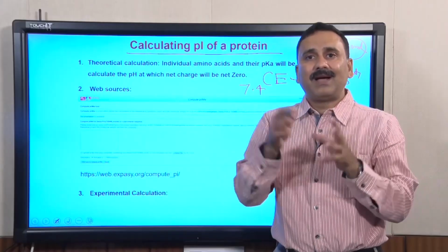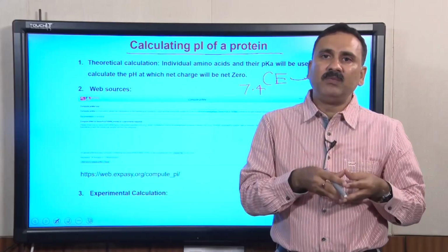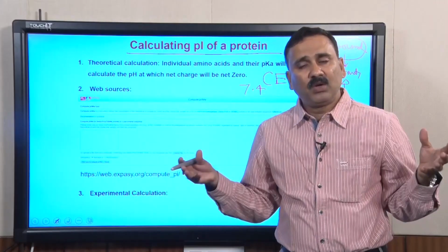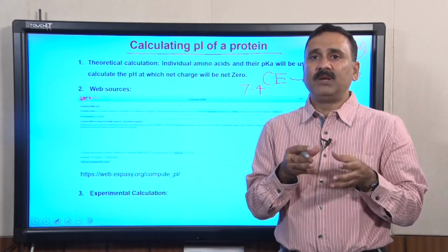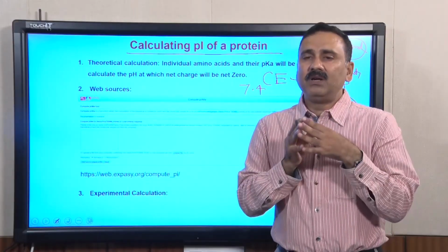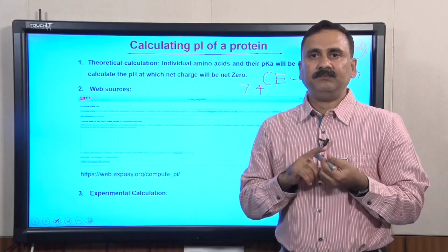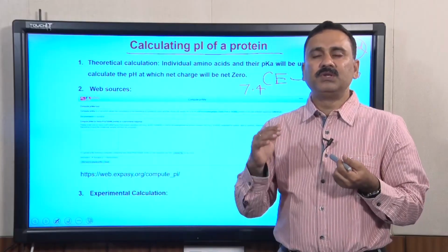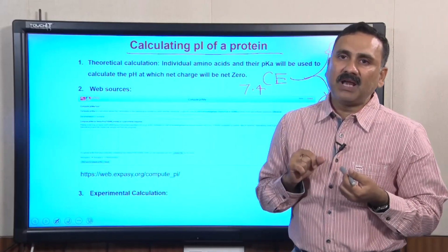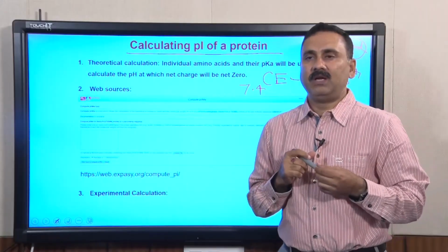But this kind of trial and error method was what people were doing when they did not have any information about the pI values, the amino acid sequences, or the genomic sequences. But nowadays you have different types of approaches, so you should not go by the trial and error method. You can very precisely use cation exchange chromatography or anion exchange chromatography by simply calculating the pI values, and there are three approaches by which you can calculate the pI values.